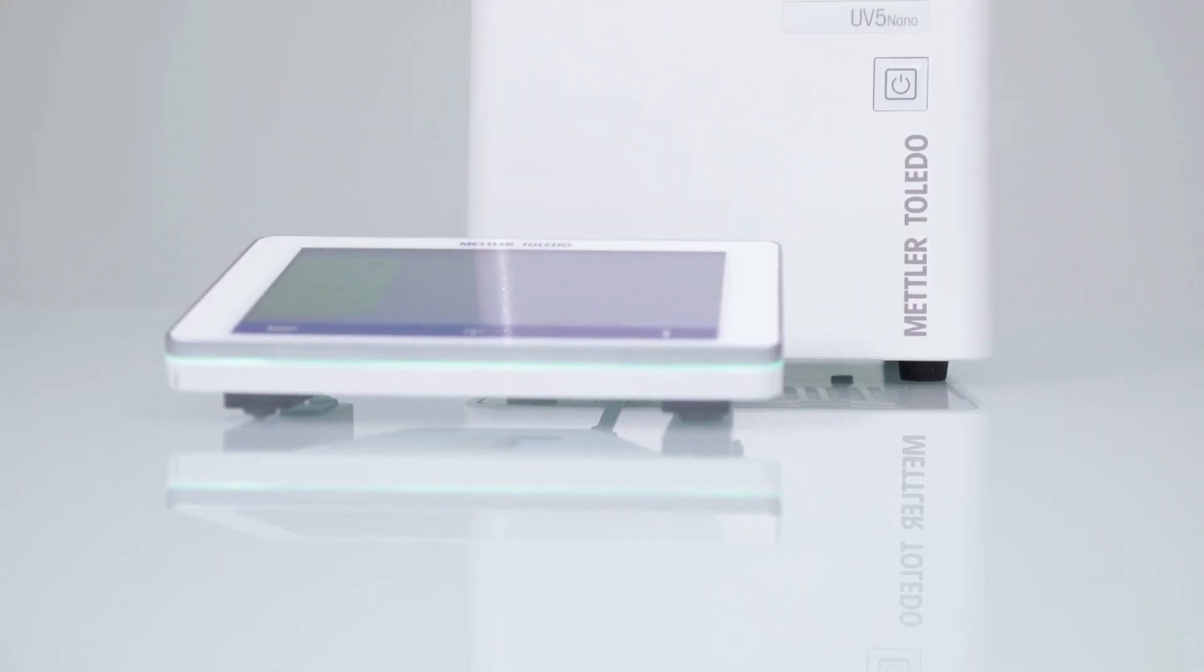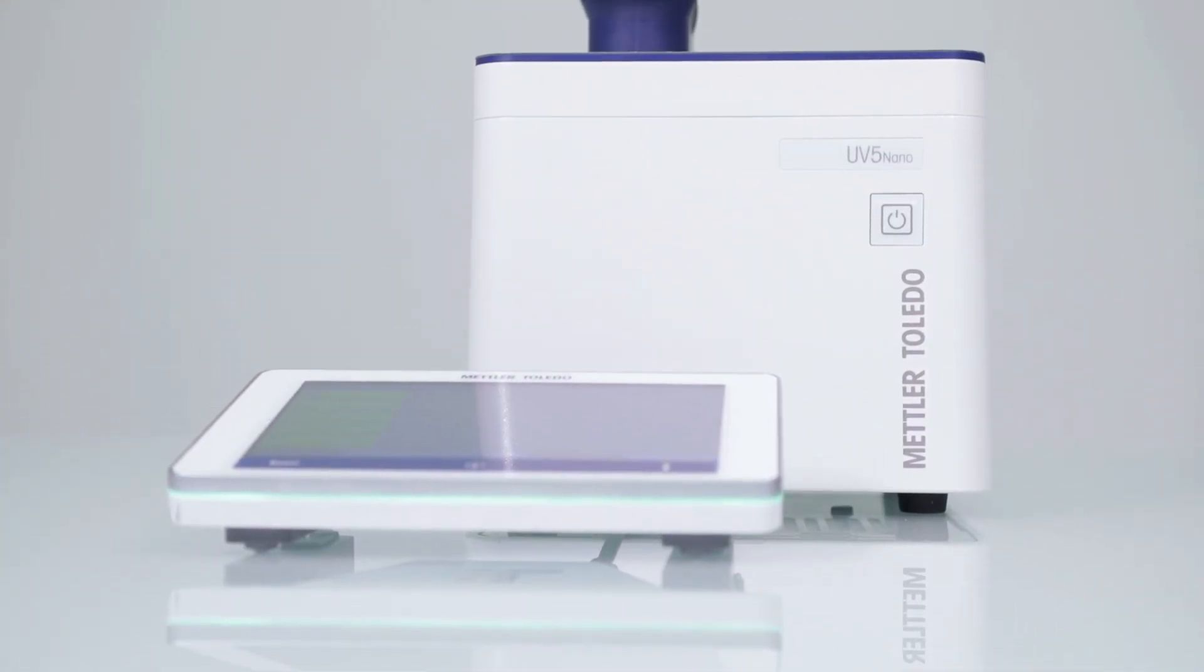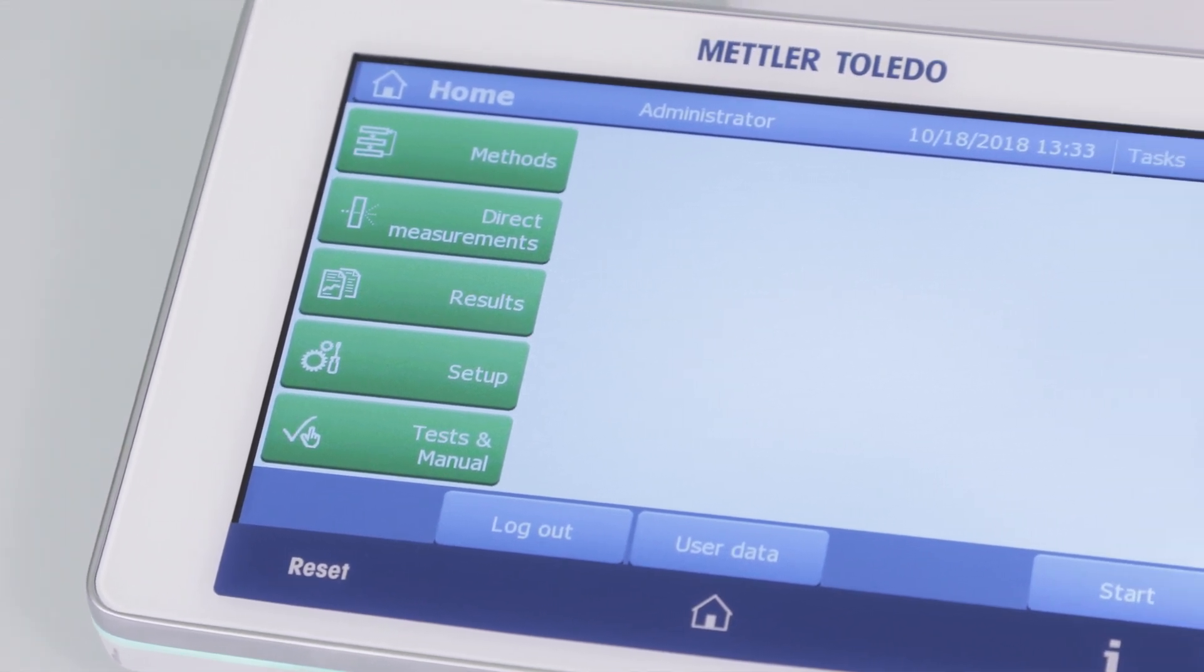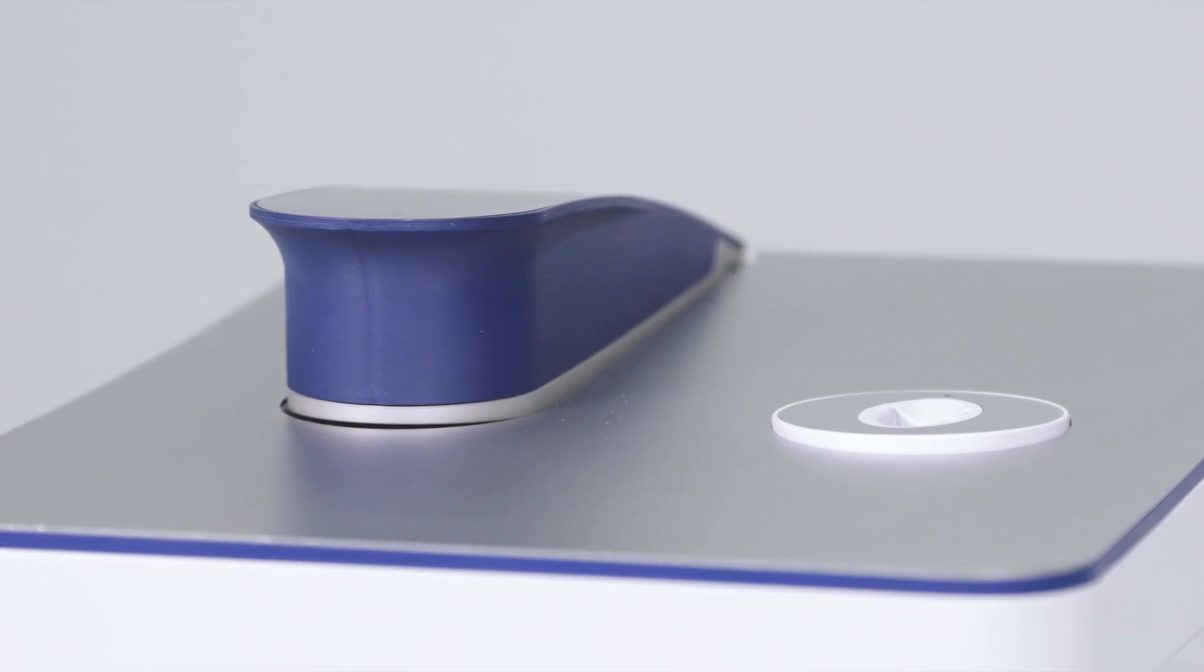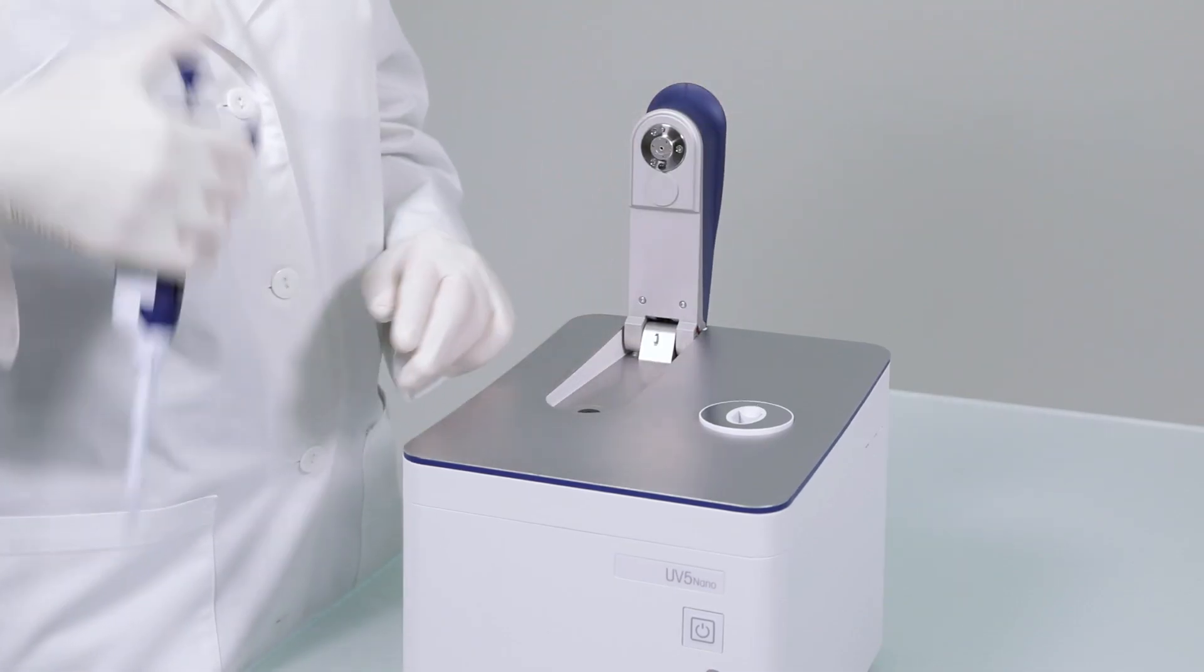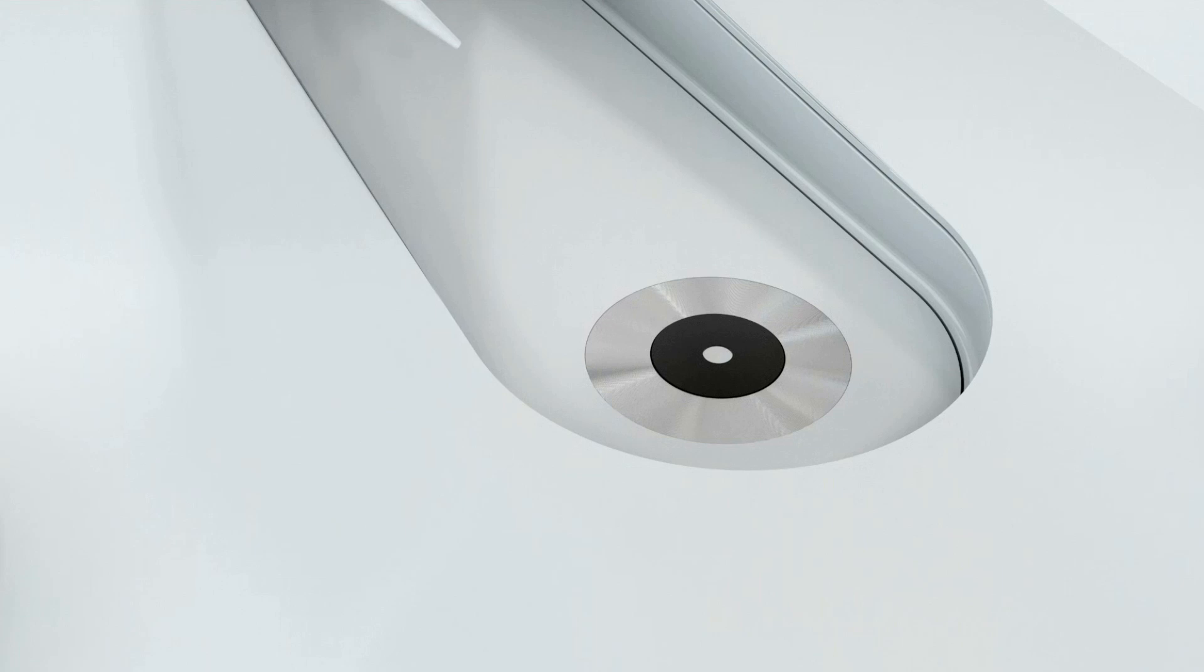The Mettler Toledo UV5 nano spectrophotometer combines two instruments in one for both micro-volume and standard cuvette measurements. With this instrument, we can pipette a tiny amount of sample directly onto the platform. Only one micro-litre is required for reliable measurements.